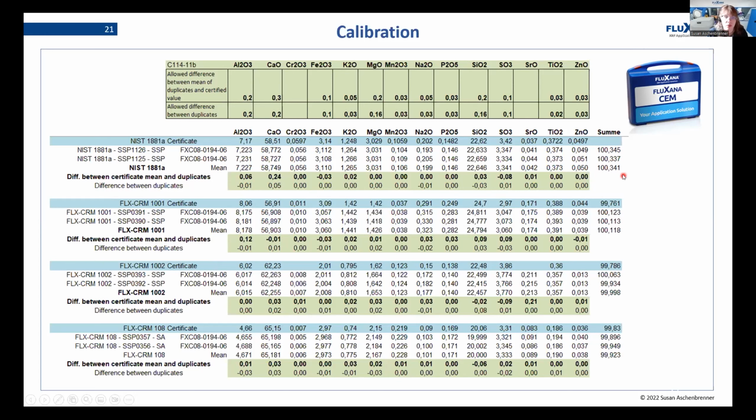Okay, so what did we do? We did basically the same thing as before. We measured twice. We did this for 7 CRMs. We can see 4 here. And we checked if precision-wise and trueness-wise we are within the ASTM levels. So we are having these limits. And again, we are checking if each number will be okay within the limits. And as you can see, green is good. For these 4, all of those are within the limits.